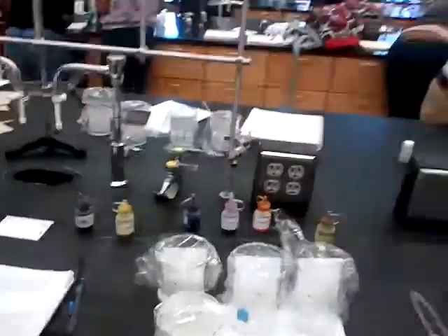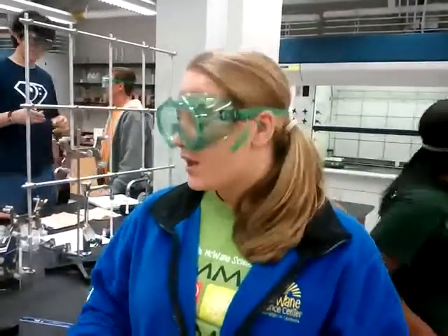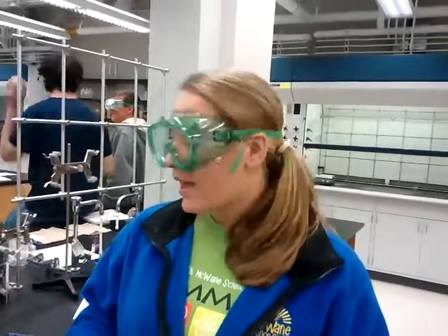And now we're going to talk about the polarities of the dyes and of our other components. So the stationary phase is less polar. If the dyes don't move up the paper with our solvent, which is more polar, then they're closer to the polarity of our stationary phase. But if they move up, as some of these have, then they're more polar.